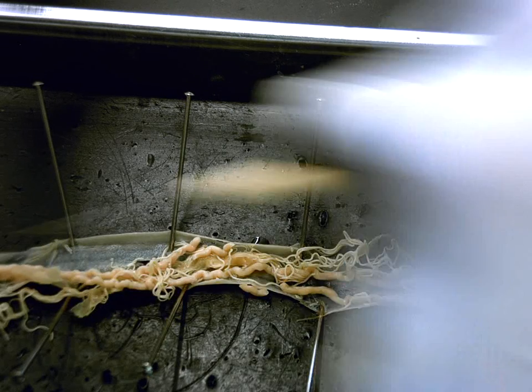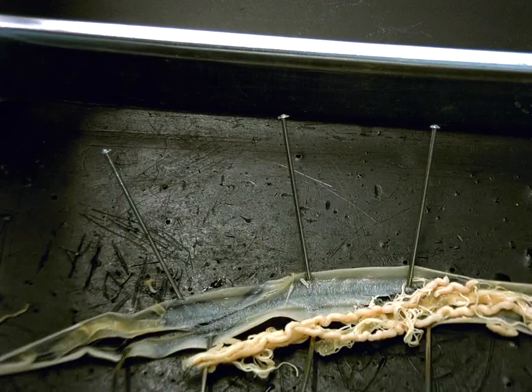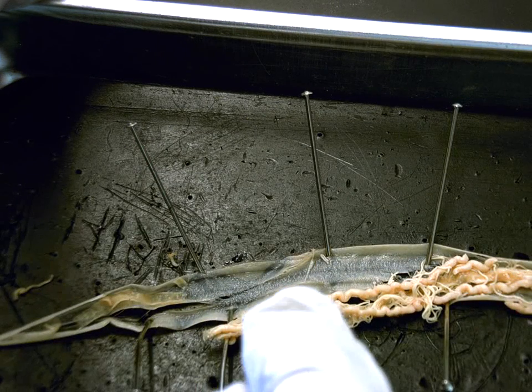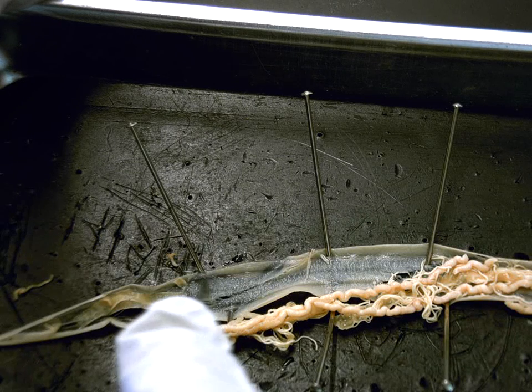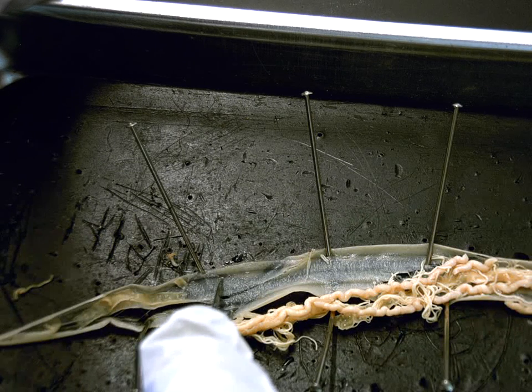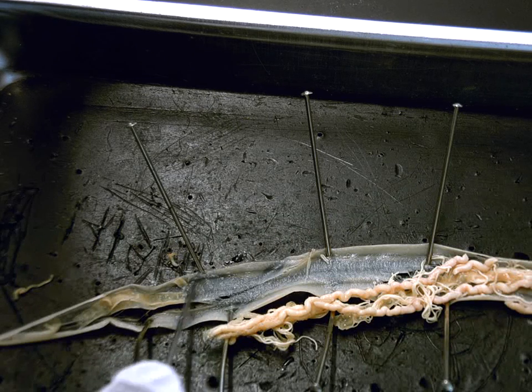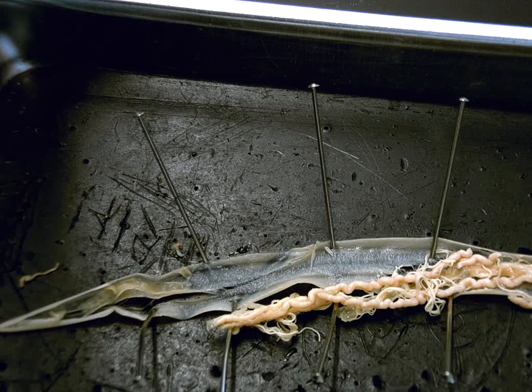And the last system in the worm, if I move the worm back, if I pull all the systems out to the side and just look at the wall of the worm, we can see the last system, which is these two dark lines, one here and one up here, the two dark lines running down in the wall of the worm, and both these dark lines would be the excretory canals or lateral lines, which is a clear tube where urine flows. And that's it. Hope that helps.